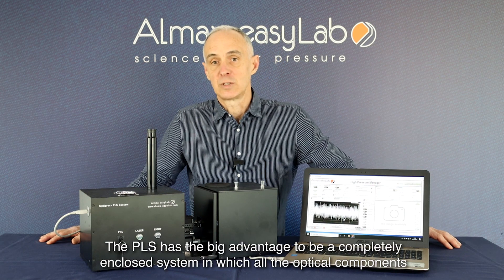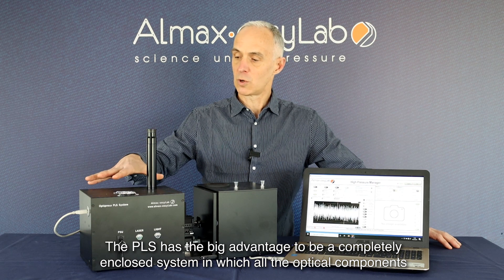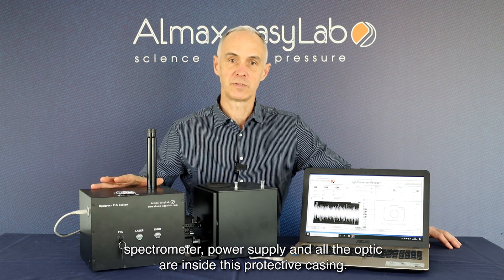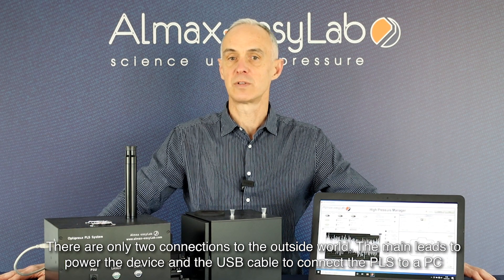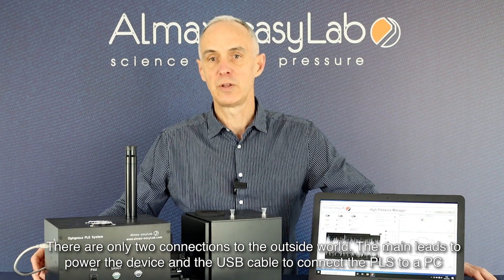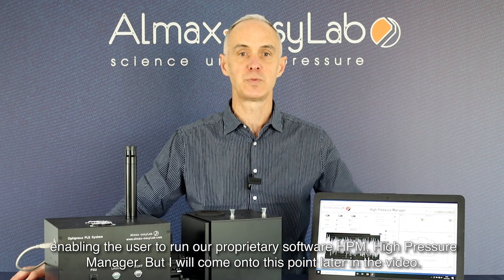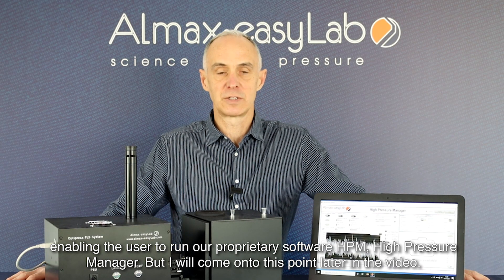The PLS has the big advantage of being a completely enclosed system with all its optical components, spectrometer, power supply, and all the optics inside its protective casing. There are only two connections to the outside world: the main leads at the back to power the device, and the USB cable to connect the PLS to a PC, enabling the user to run our proprietary software HPM, High Pressure Manager — but I will come back to this point later in the video.